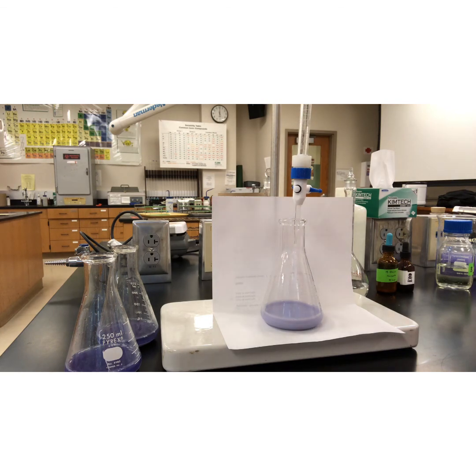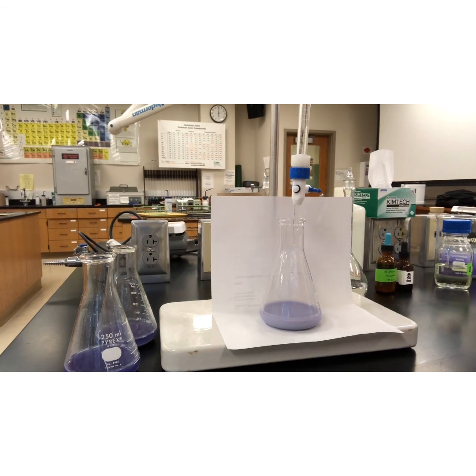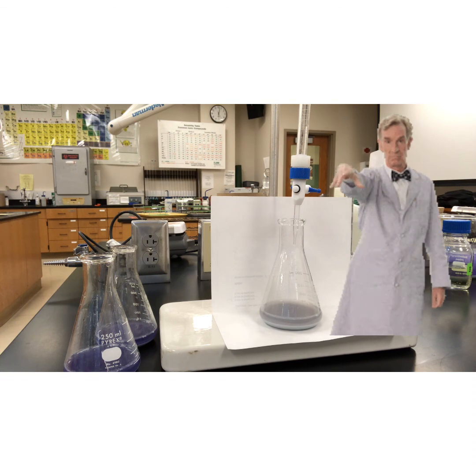All right, so my endpoint this time is 18.18. Let me double check my delta V's and see if I want to do another run. See if they're close to one another. Okay, my delta V's checked in at 17.86 milliliters. And for run 1, titration 2 was 17.80 milliliters, and titration 3 was 17.87 milliliters. Kind of nailed it. Pretty good. So I'm going to go ahead and call it.